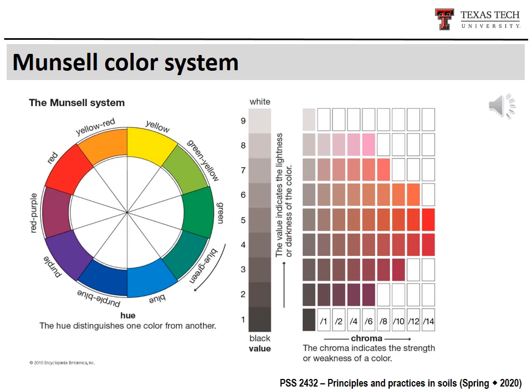Chroma means the color intensity. Basically, chroma is the color intensity. And the value means the lightness or darkness of the color. Okay?